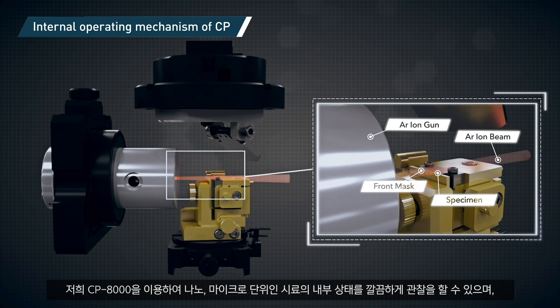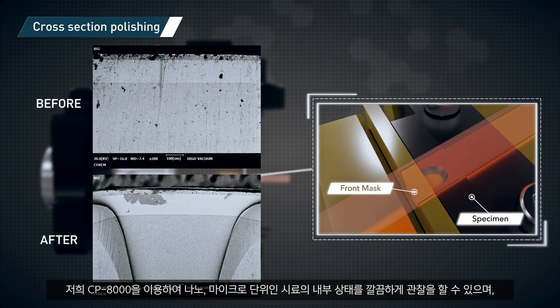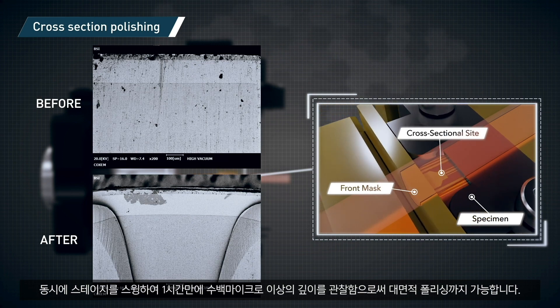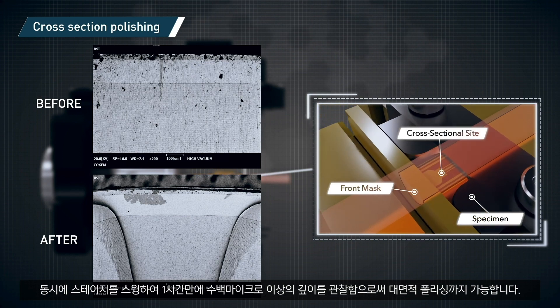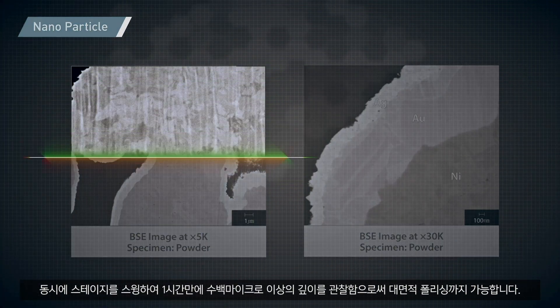The CP8000 allows clear observation of nano and micro scale areas inside the sample. At the same time, large area polishing can also be done with the CP8000, which, through its swinging stage, makes possible the observation of a few hundred micron thick areas within one hour.